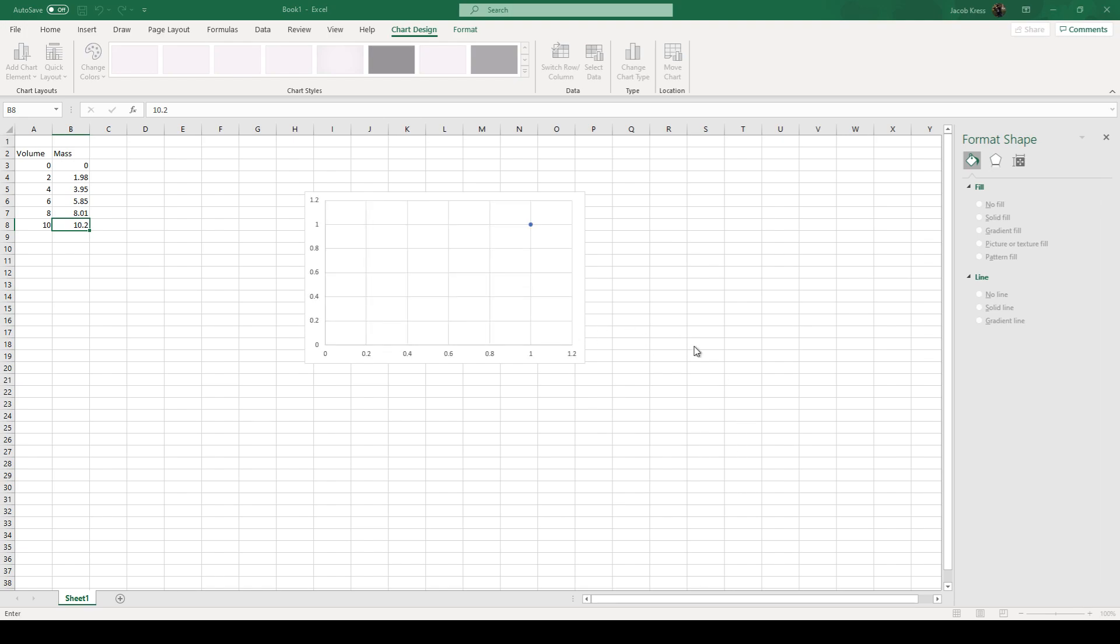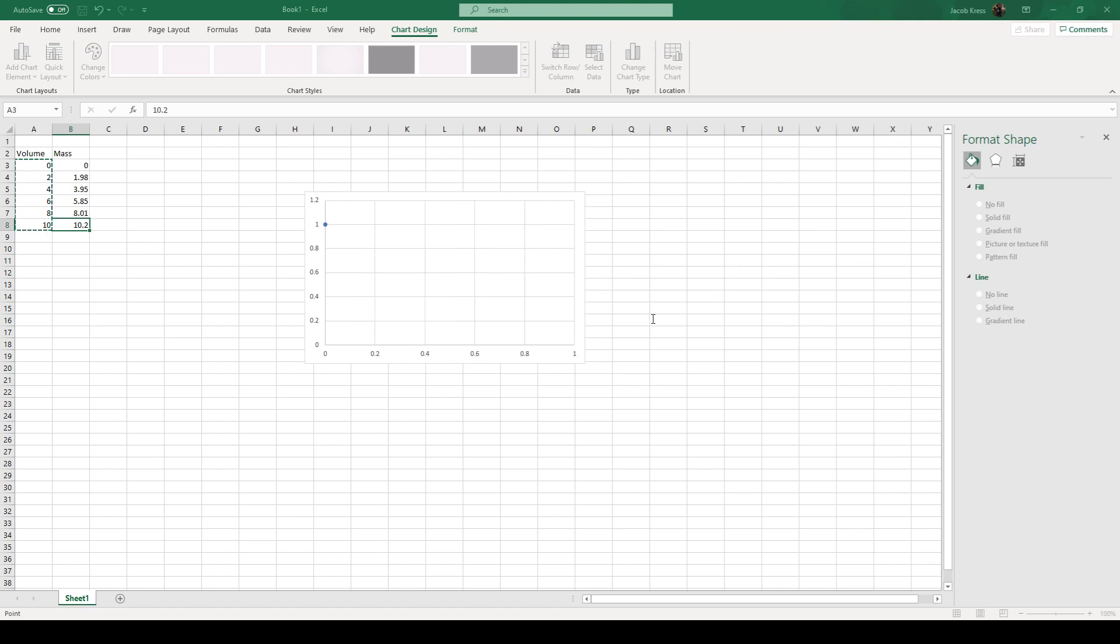We're going to hit add. So remember we want our volume to be our x value. So I'm just going to click and drag. That's going to select all those values. Hit enter.